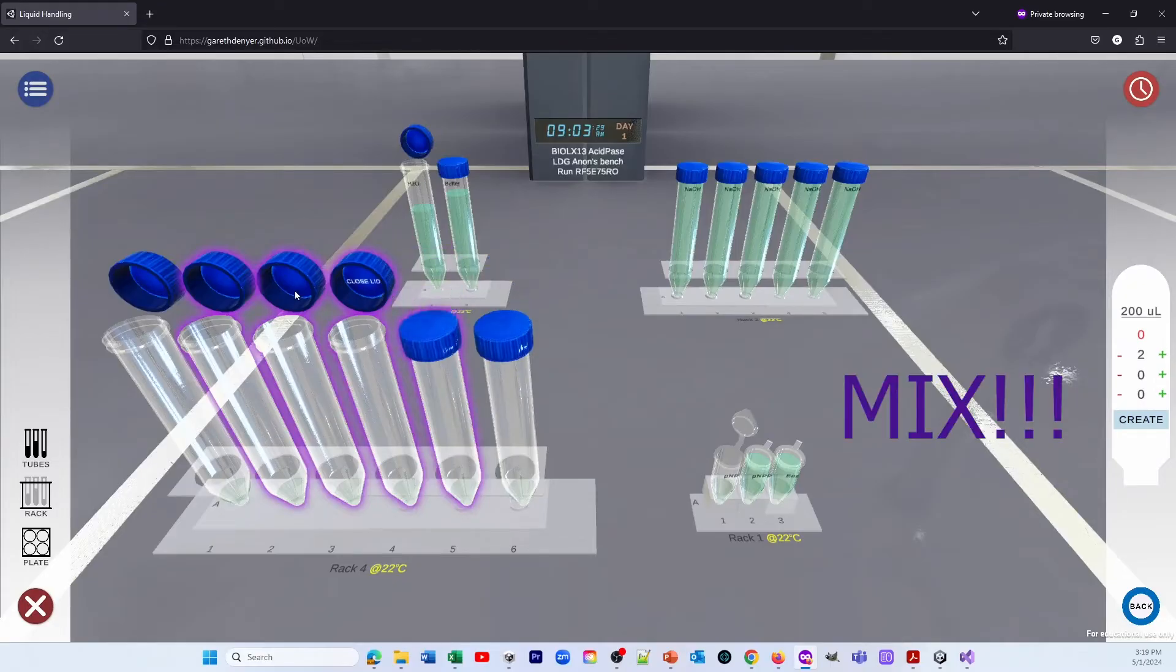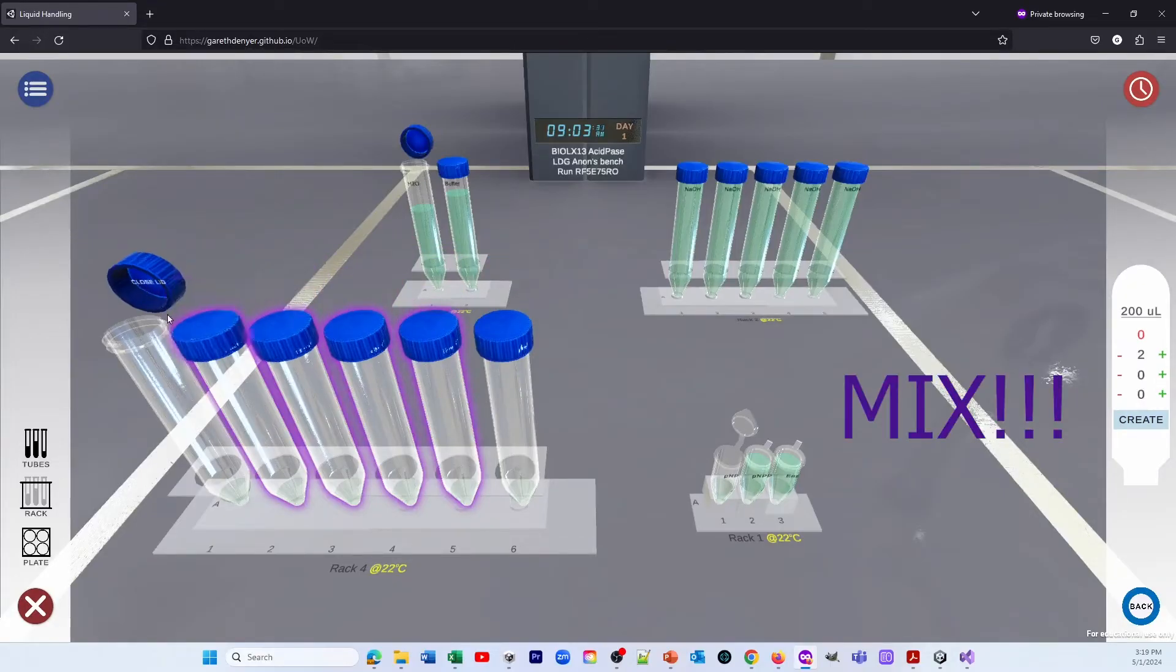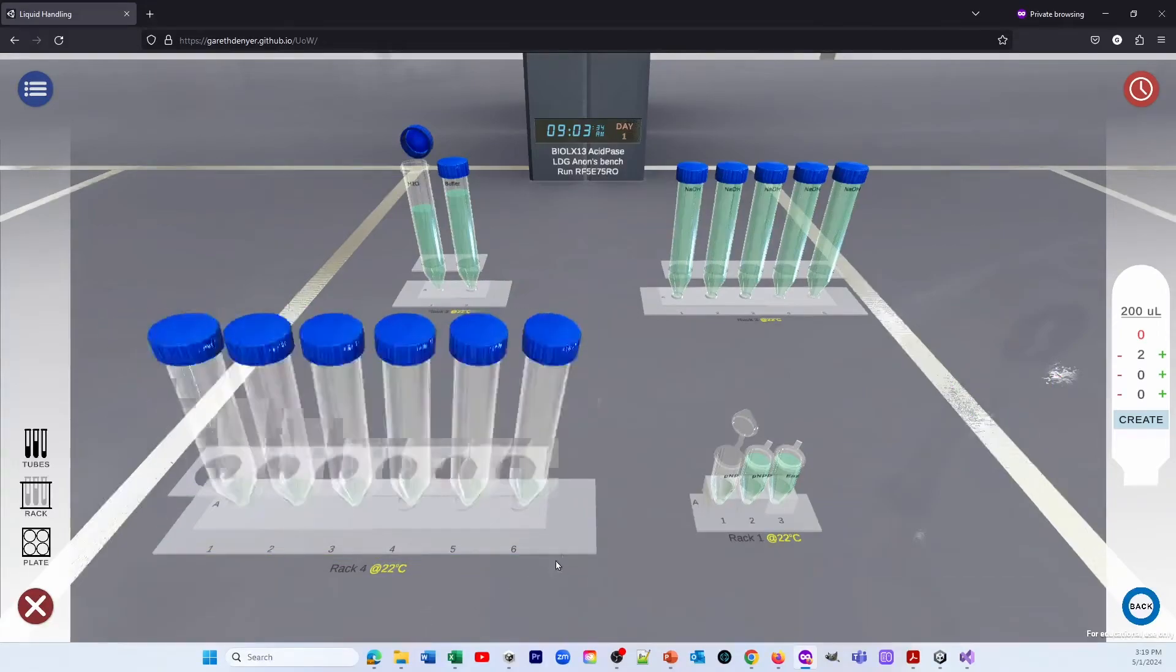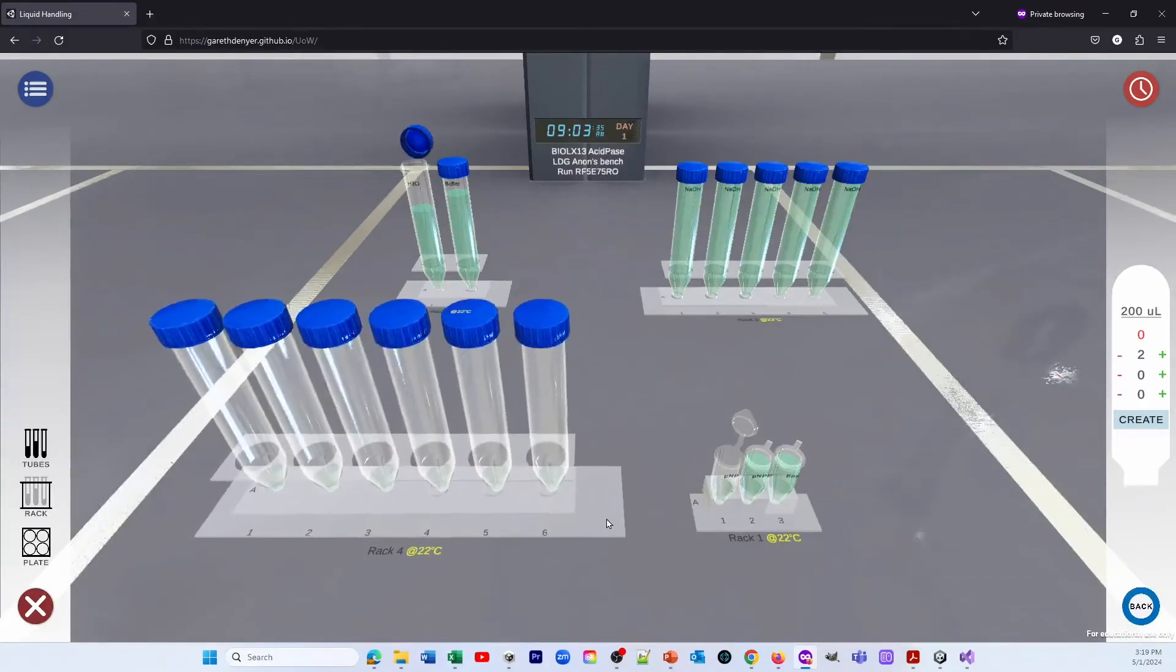But they'll all be different concentrations. Now, very important that we mix. So we select the rack, choose mix, and that mixes them all very nicely.